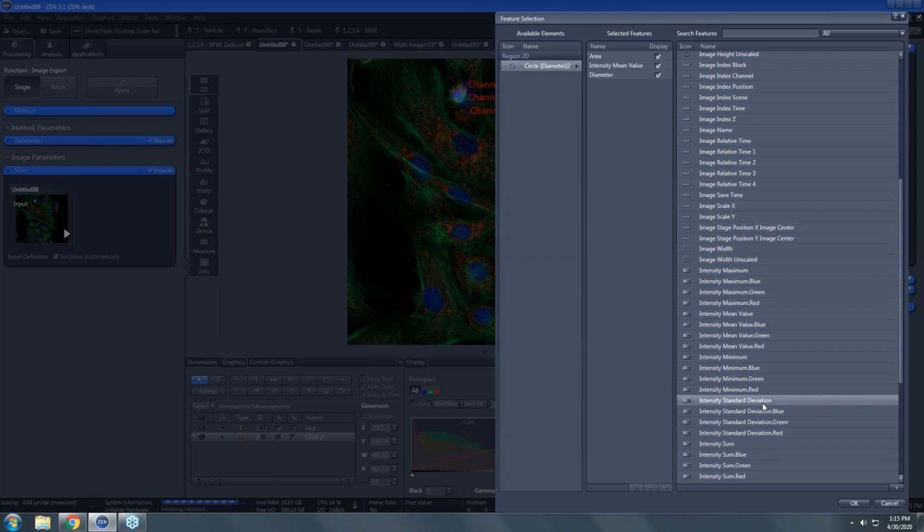You see that there? Yeah, standard deviation. And then there we go. It's going to make the image rather busy. So if we look in the second column that has all of our annotations, what we're measuring, you can see we can toggle off the display. So let's, I don't know, toggle off any number of those, Nicole, so that we can see that we're not going to annotate the image with those.